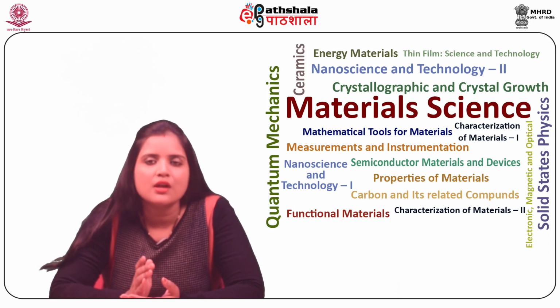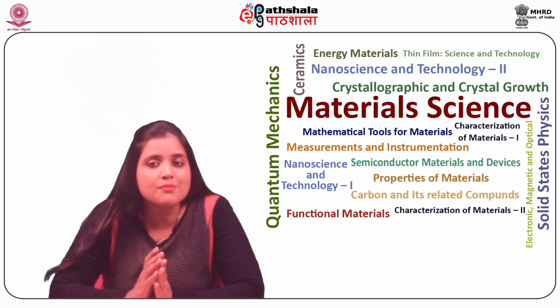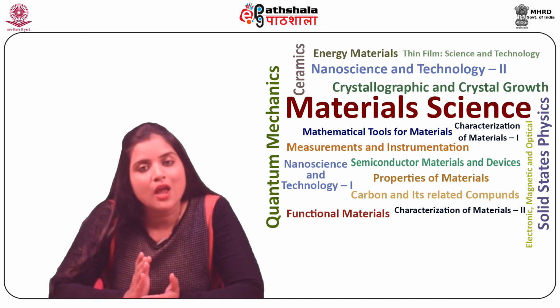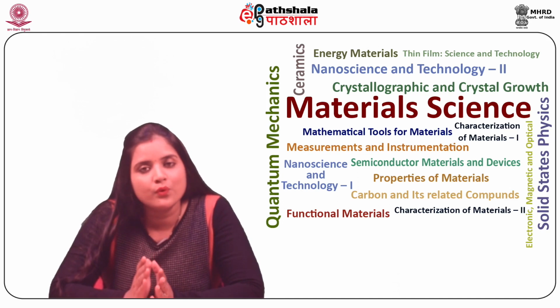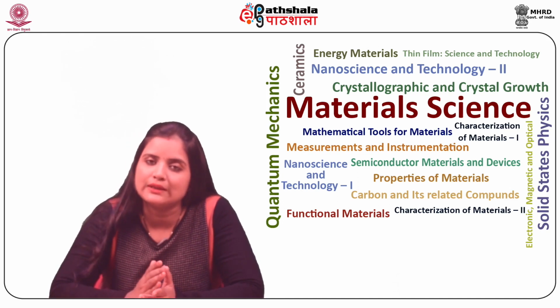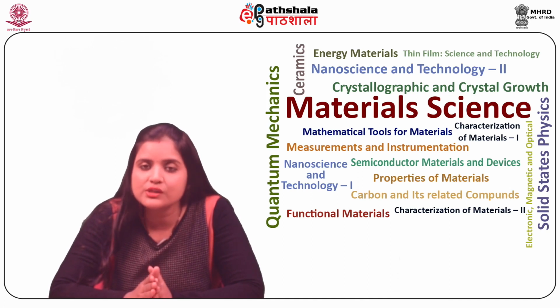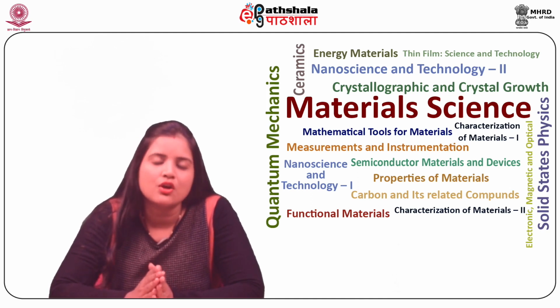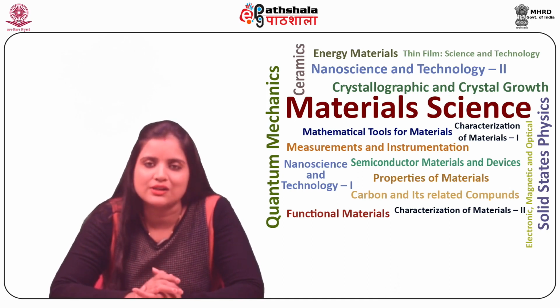Non-optical methods such as electron microscopy and tunneling microscopy have been invaluable in our understanding of the world on a smaller scale. But these suffer from their own limitations and can't benefit from the centuries of studies using light.